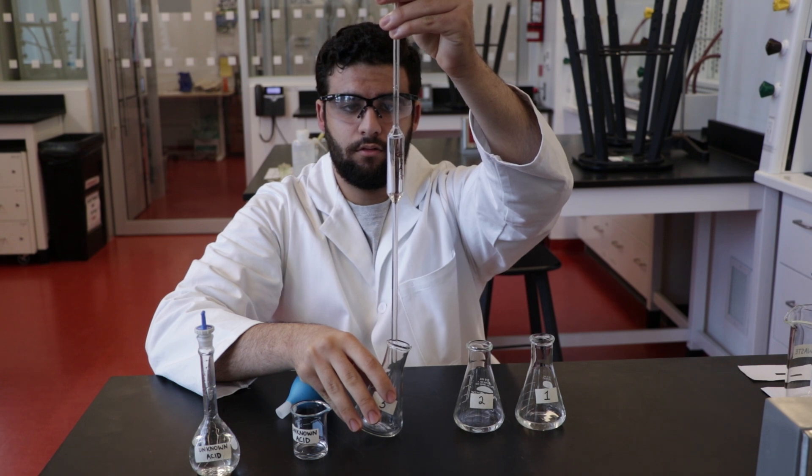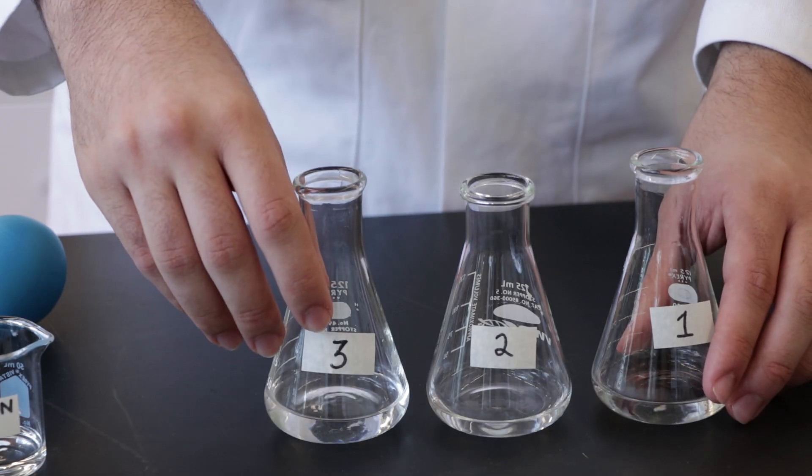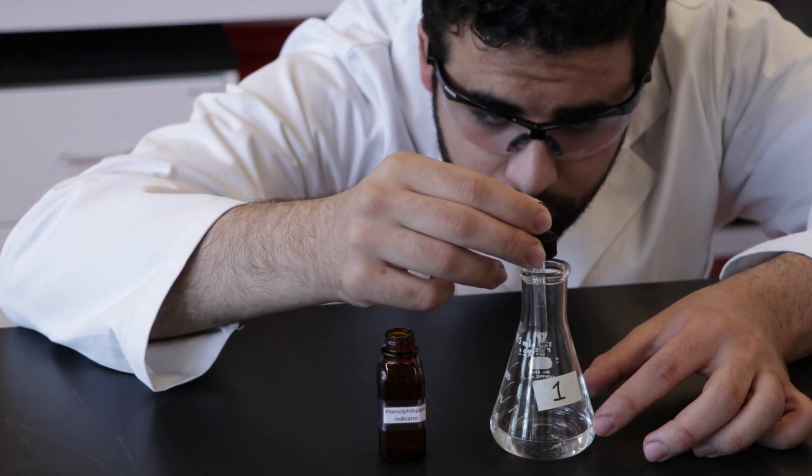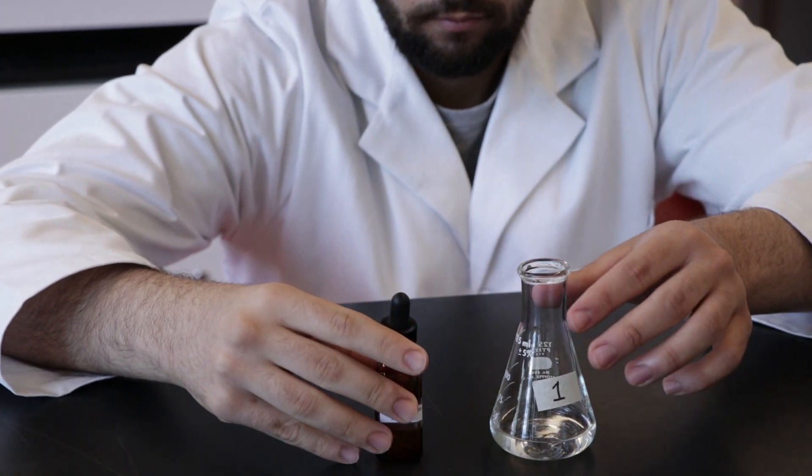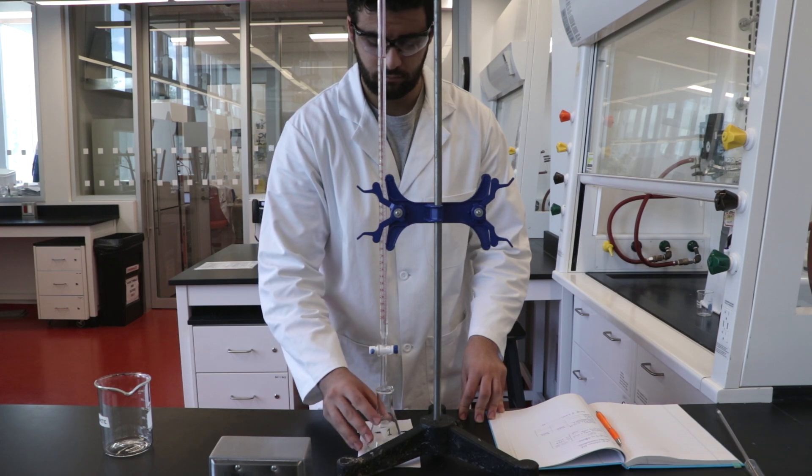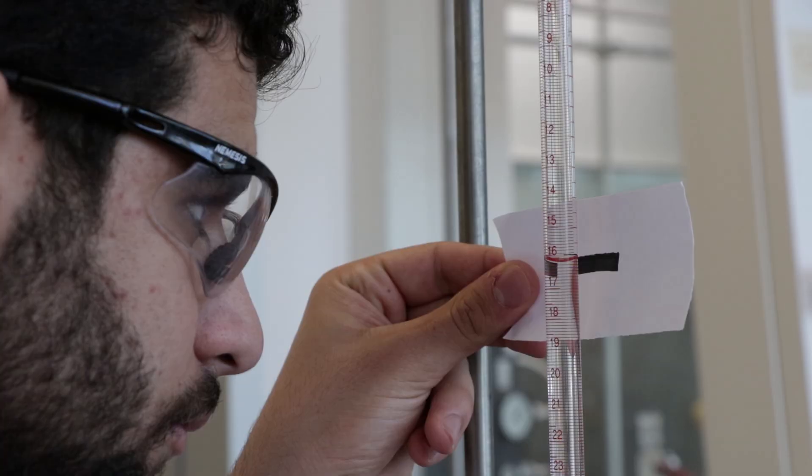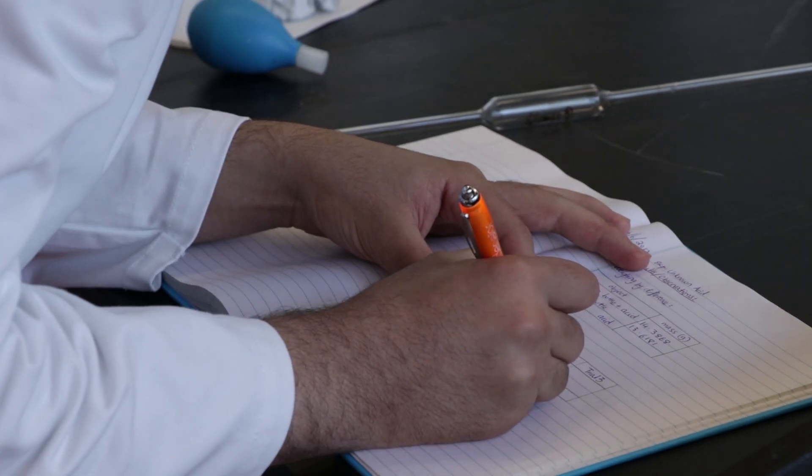Pipette three 25 ml aliquots of your standard solution into three labeled Erlenmeyer flasks. Add two drops of phenolphthalein indicator into each flask. Place the first flask under the burette and take the initial reading before beginning the titration. All readings from the burette should be recorded to two decimal places.